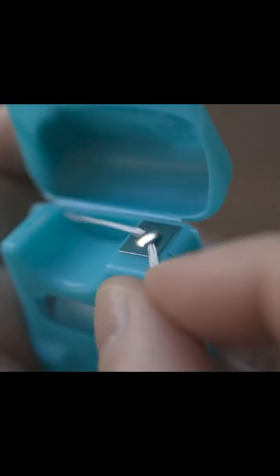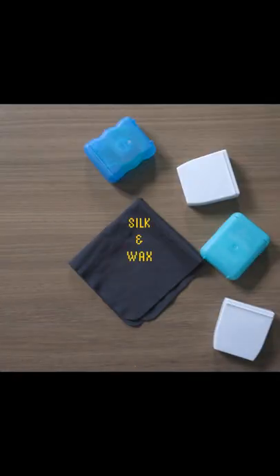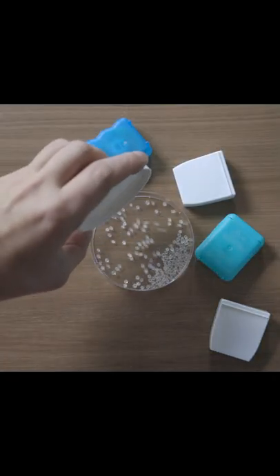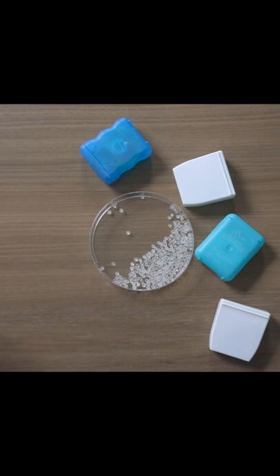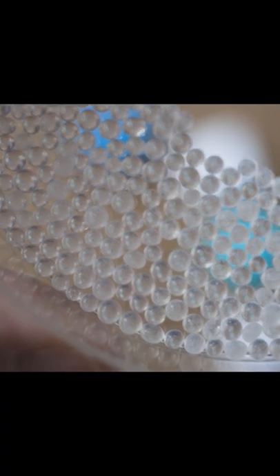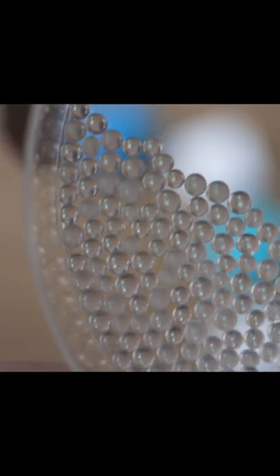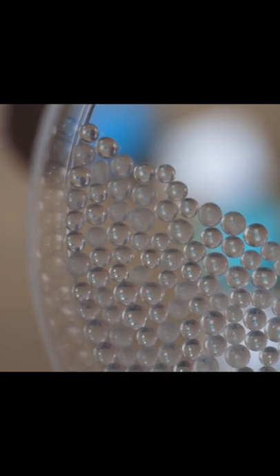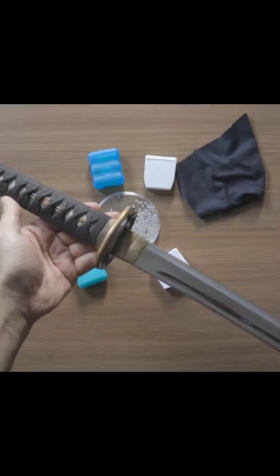During the 1800s, dental floss was made of silk and wax. Today, manufacturers use plastic beads like these. They stretch and fold these beads until the floss becomes very strong, just like how Japanese swords are made.